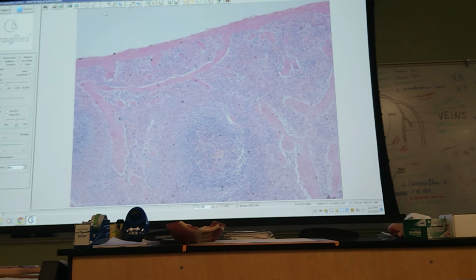And they ultimately all connect to the capsule. I stopped here because you have a great example of a trabecula that actually shows you its connection to the capsule. Even all these are trabeculae, and they ultimately connect to the capsule.